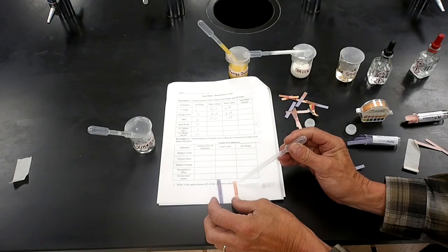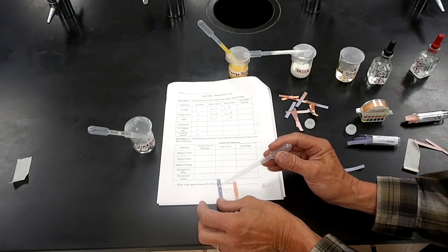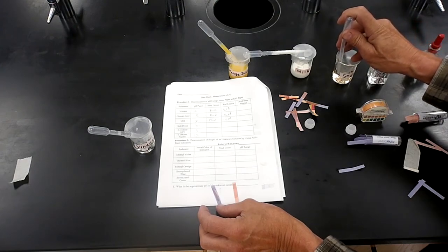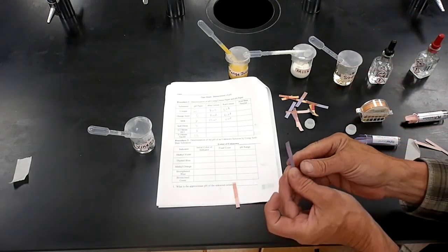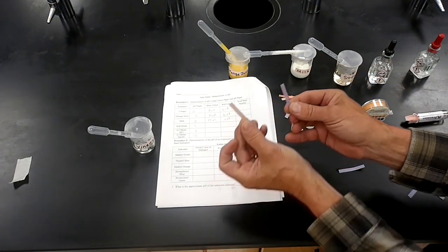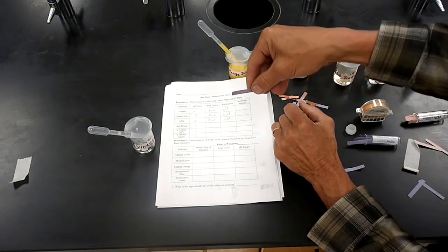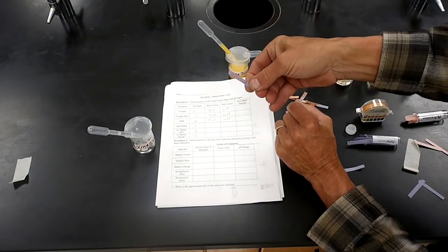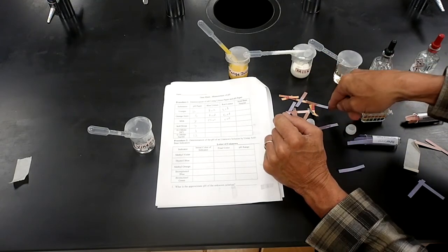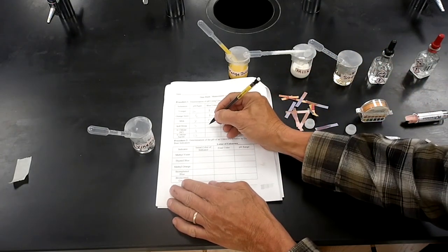Red litmus paper. Red is definitely red. Blue, it's reddish where the soft drink is. So we'll go red and red.